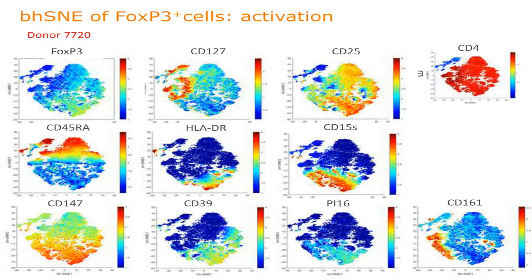So we can go ahead and take a look at our FOXP3 positive cells and then look for CD4 positive T cells. And you can see when we did our gating that there's some blue cells. So there's some cells that fell into our gate that were not all CD4 positive T cells. But we want to look at this FOXP3 high population here, along with other things as well.